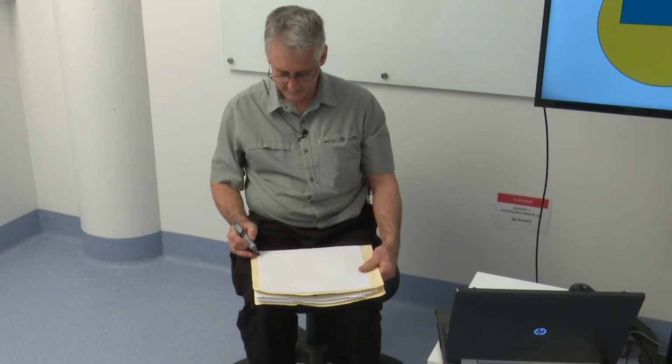If we think about our A4 sheet as basically the scanning pattern equivalent to the SEM image that we see on the SEM screen, we can think about this region of the sample as being divided up into pixels.